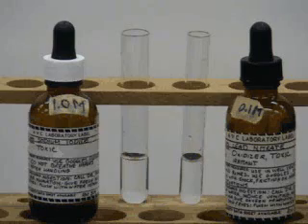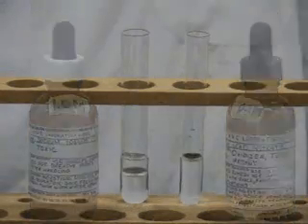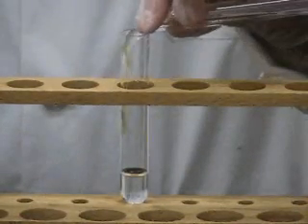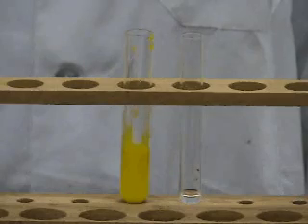This next reaction involves solutions of sodium iodide on the left and lead nitrate on the right. Record your initial observations. We will now mix the solutions. And record your final observations.